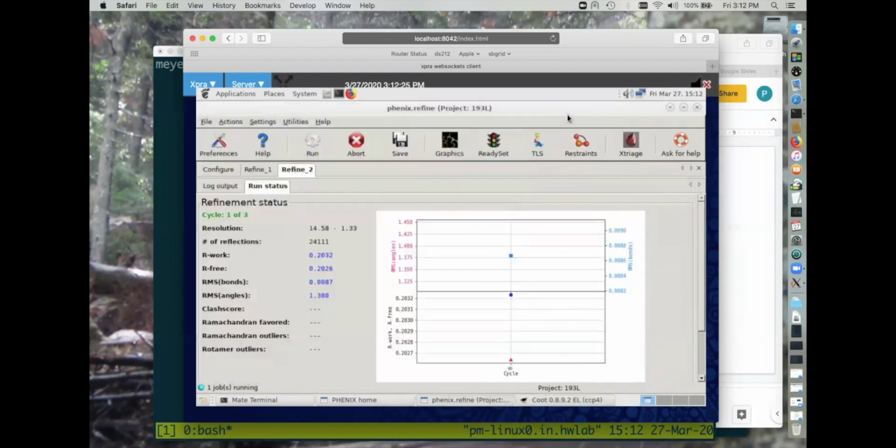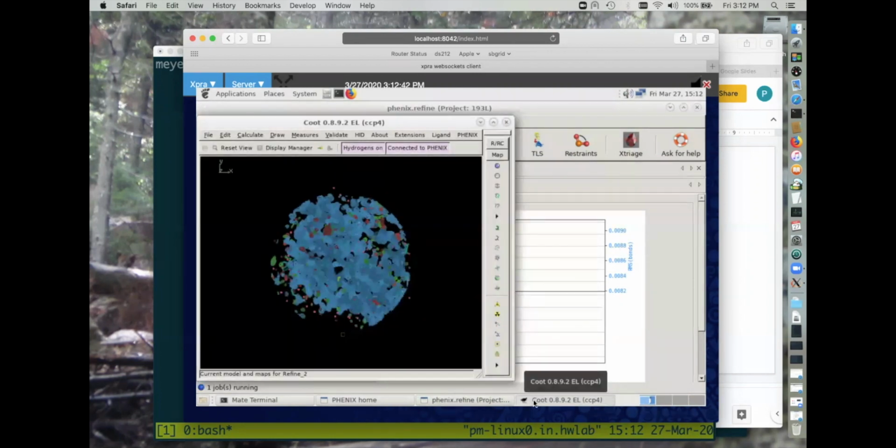So now we have better graphics. We have graphical plots that people have thought about the UI for: how do we present this information, how do we report errors, how do we show things that are a lot clearer than looking through the text file and hunting around for what I'm looking for. And now we're up and running.